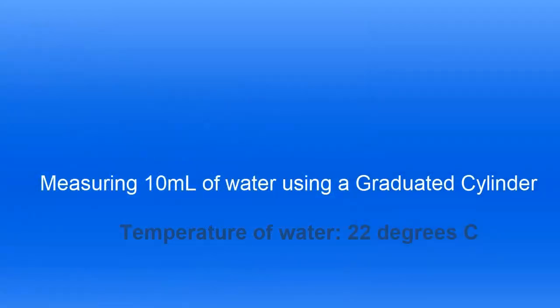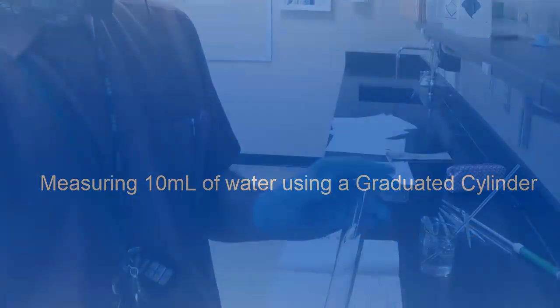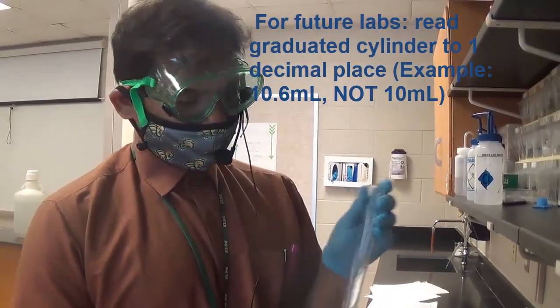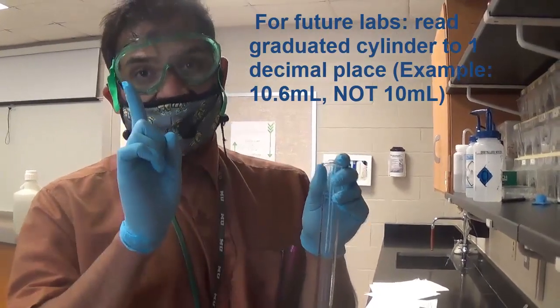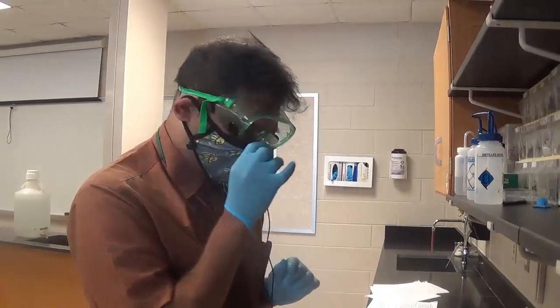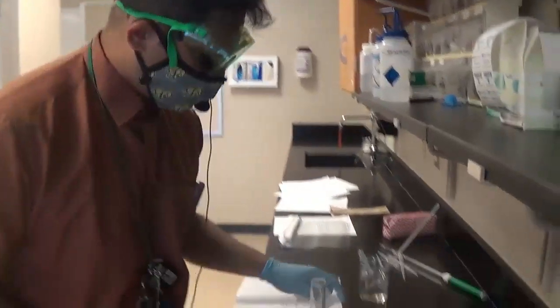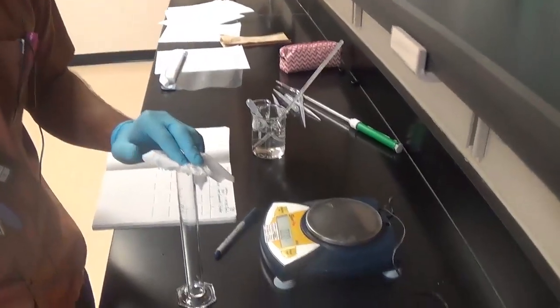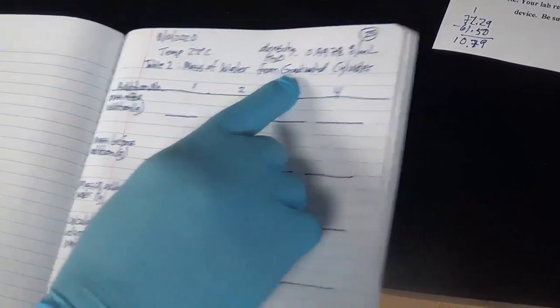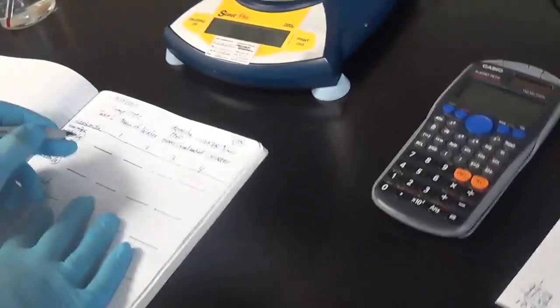Now let's do our next instrument: the graduated cylinder. One important thing to know about a graduated cylinder is that you read it to one decimal place. Let's weigh the empty graduated cylinder. Zeroing the balance, the weight of the empty graduated cylinder is 88.76 grams.